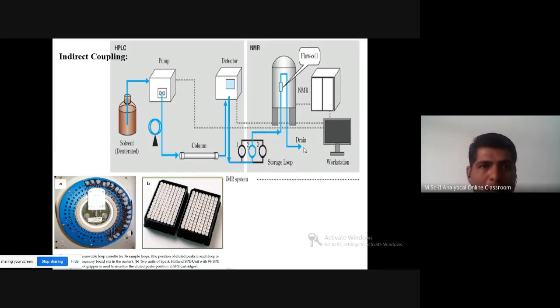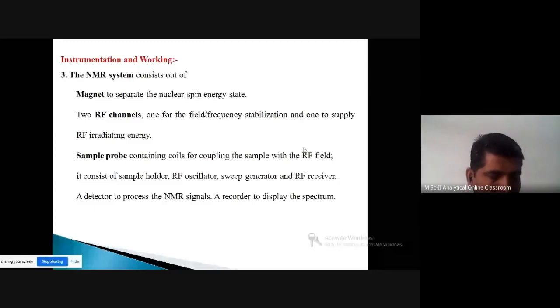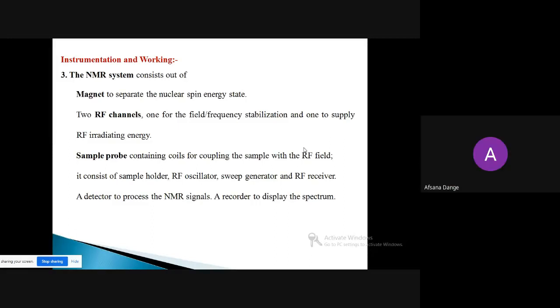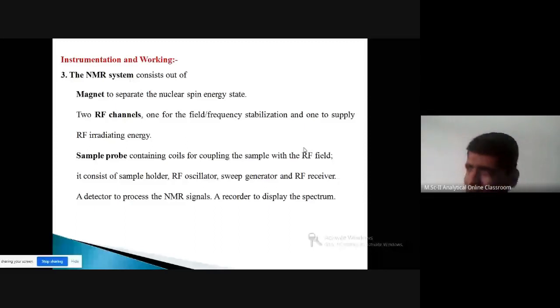ओके, नाव वी आर गोइंग टू सी अबाउट द इन्स्ट्रुमेंट पार्ट ऑफ NMR आणि इट्स वर्किंग. तर NMR चं तुम्हाला सगळ्यांना माहिती आहे इन्स्ट्रुमेंट पार्ट कुठले कुठले आहेत आणि वर्किंग कसं हे होतं हे तुम्ही TY मध्ये शिकलेलंच आहे. ओके, काय काय आठवते तुम्हाला, आठवते काय. सांगा एनएमआर मध्ये कुठले कुठले इंस्ट्रुमेंट पार्ट आहे, थोडस डॉक्युमेंट हे द्या. ऑपोजिट मॅग्नेटिक पोल्स. ओके, मॅग्नेटिक फील्ड आहे पहिला. अजून काय काय आठवत, इमेज आठवते का बघावर?